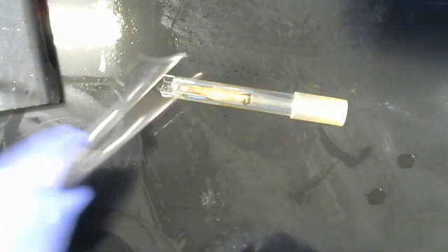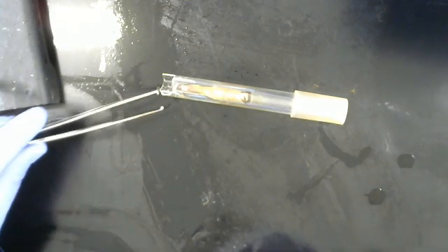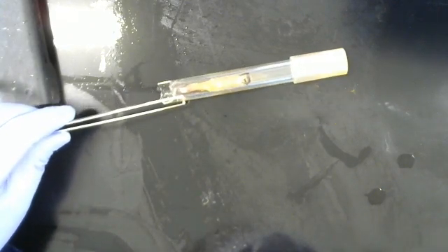To remove something of this nature, using your tweezers, you want to pick it up carefully and bring it over to your biohazard bin and simply drop it in.